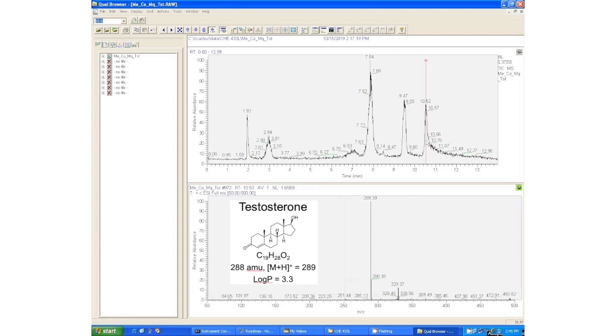And that is, it's a useful trick if you don't see a peak that you expect to see. So there's something you expect to be in there, you know that it's in there, you can hunt for it by specifying the mass in the chromatogram. Also if you have overlapping peaks in the LC, your chromatography didn't go well, then you can separate those peaks by searching for specific masses.